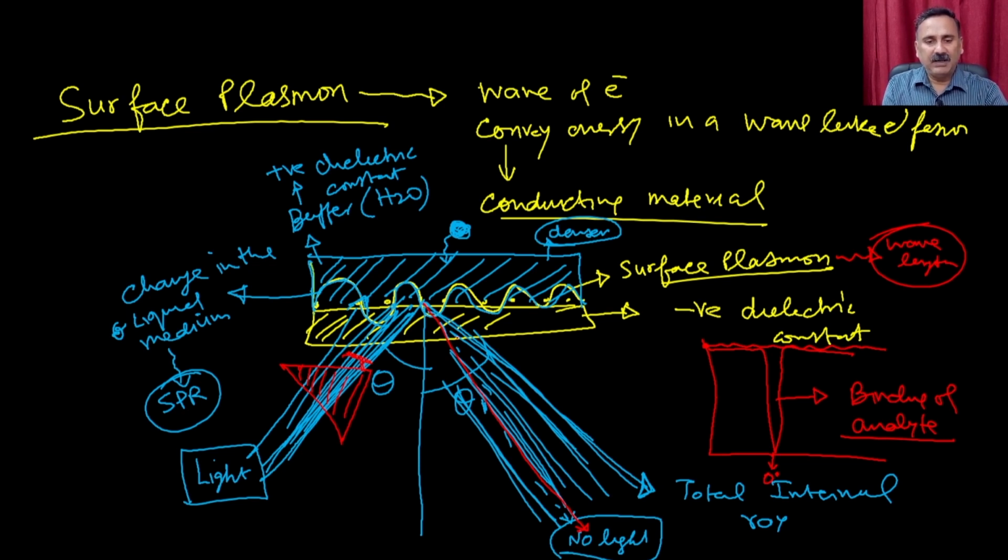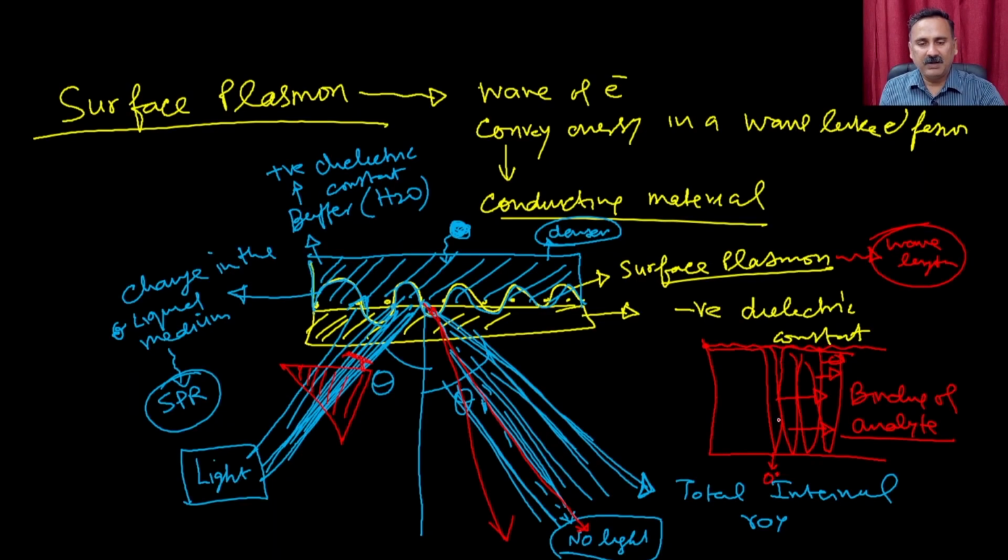So when there is a binding, the angle is going to move to this side. Okay, this means you will see a binding, right? You are going to see another binding, and another binding. So it will keep shifting as the molecules are binding, because if one molecule binds you will see one shift. If another ligand binds, you are going to see the binding. Okay, I'm going to show you in the next slide how it actually happens.